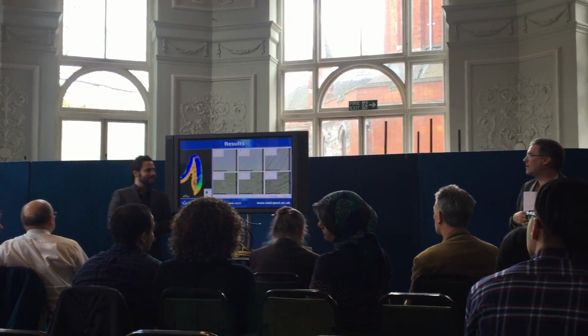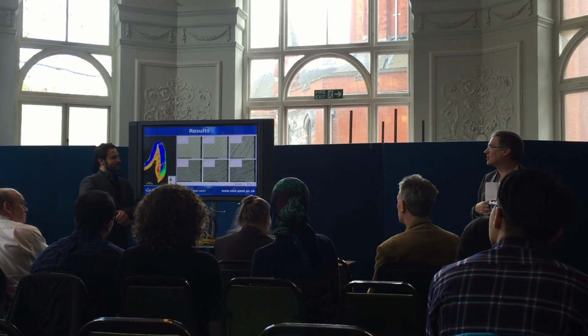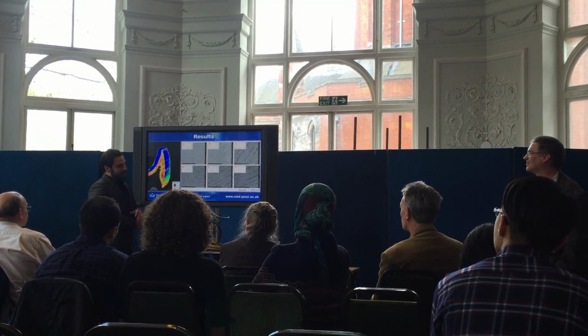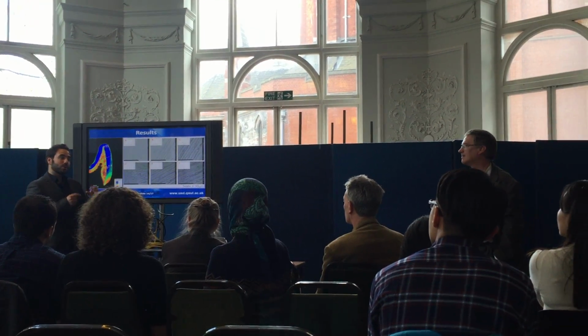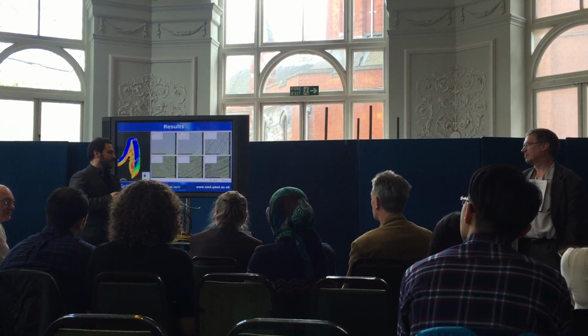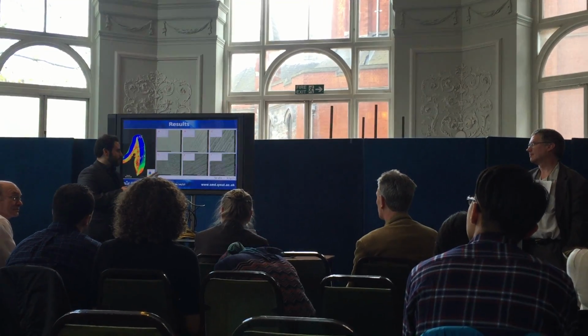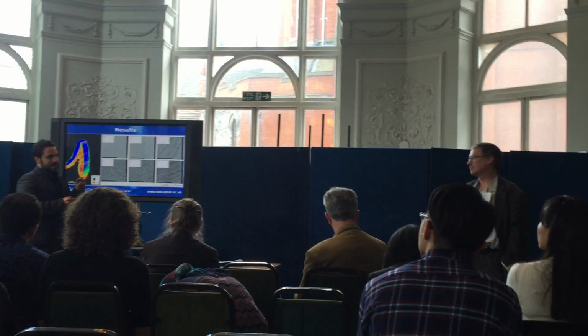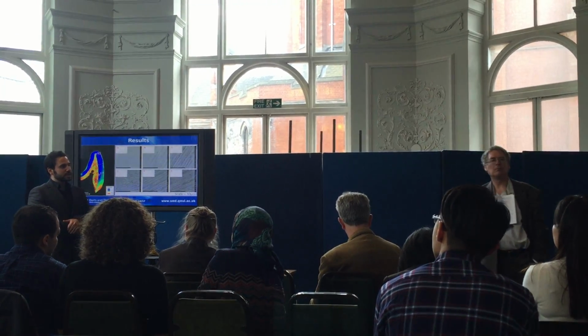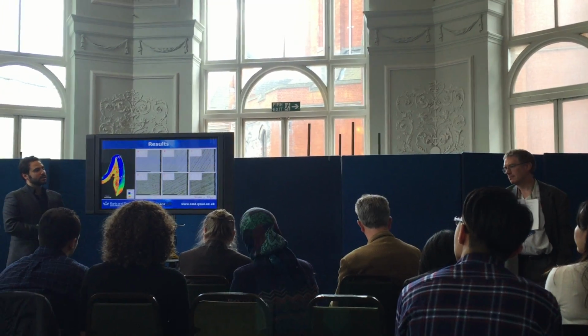Can you also look at aprismatic enamel? Well, we can look at it in the future, but the spot size of the X-ray beam we use is 20 microns so far with these experiments, and the aprismatic enamel layer is less than that. You need a smaller beam size to study it.